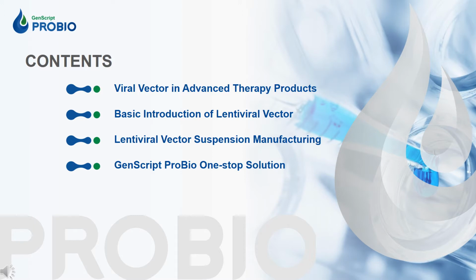Today's webinar includes the following 4 parts. Firstly, I'll introduce the market perspective of lentiviral vector in cell therapy, and I'll give you a brief introduction about the basic structure of LVV and how it works. Then, followed by manufacturing optimization strategies, I'll also share some successful data. Finally, what we can help to accelerate your cell therapy project will be included.